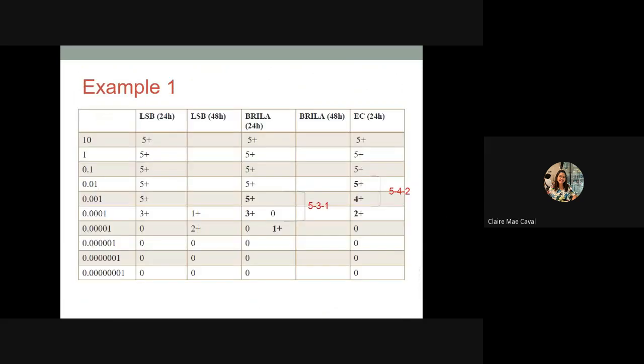So I'll just give an example because I know you got confused in reporting. This is also the challenging part in the multiple tube fermentation technique. I have handled trainings, even for professionals, and even I from the start really found this confusing because of the specific rules and guidelines. But anyway, it's always really just the last three positive dilutions.